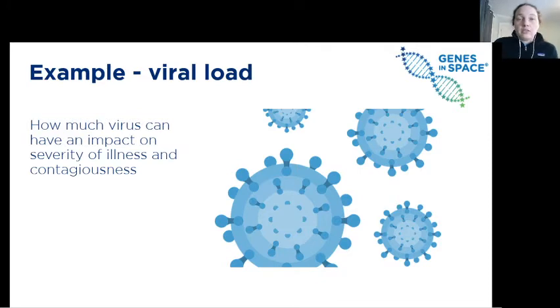One example would be the HIV virus. That virus causes AIDS and has been particularly well studied in recent years. What scientists know is that if the amount of HIV virus rises above a certain threshold, it tells you that the patient may be experiencing a more severe form of the illness, and it may be time to, say, change the treatment regimen that the patient is on, or take some other action to help the patient. And PCR, followed by a technique like gel electrophoresis, can't tell you how much HIV was present in the sample. It just tells you whether or not it's there.